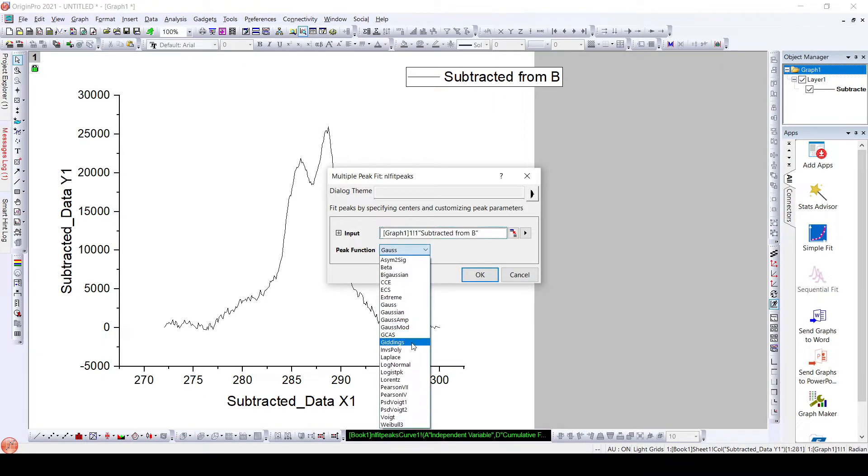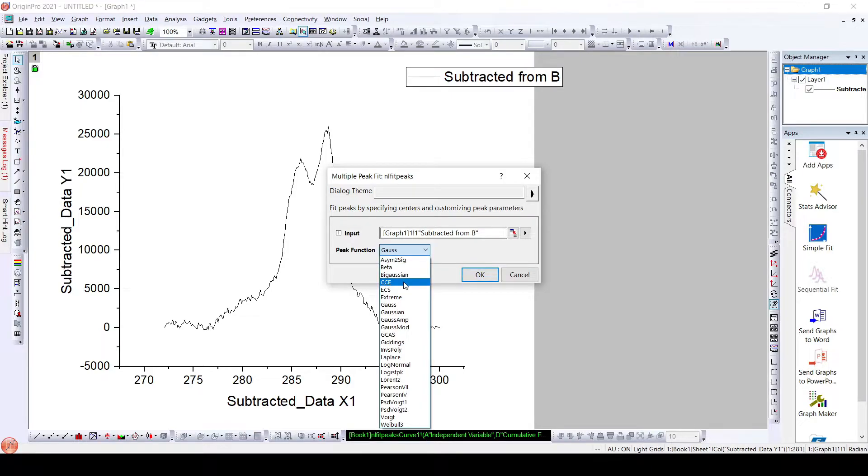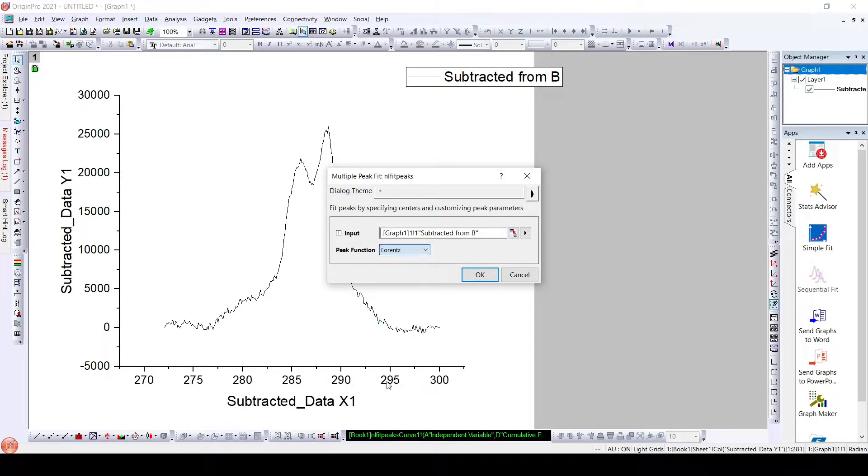Here there are multiple peak functions we can choose to fit this data. I will choose the Lorentz peak function. Now click OK.